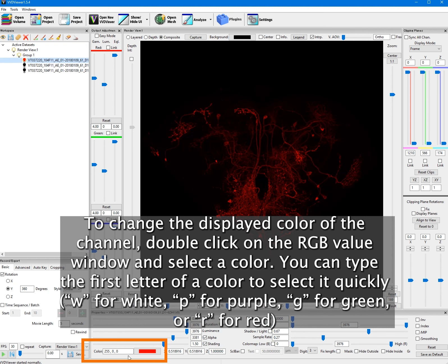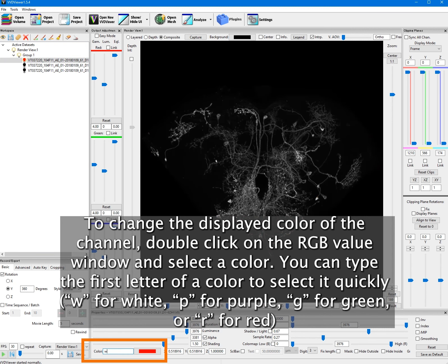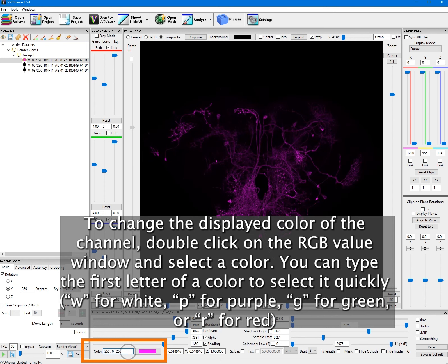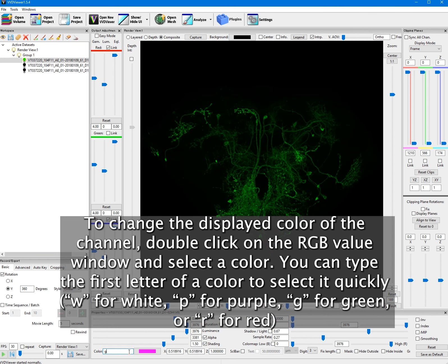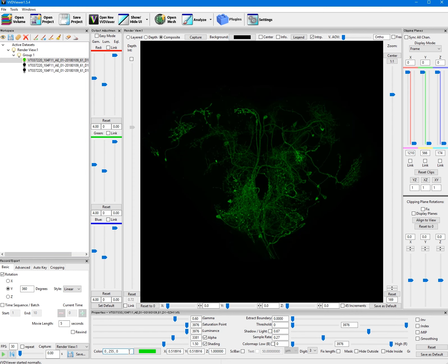To change the displayed color of the channel, double-click on the RGB value window and select a color. You can type the first letter of a color to select it quickly: W for white, P for purple, G for green, or R for red.